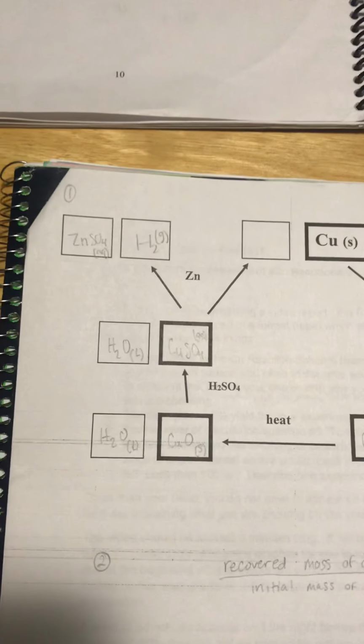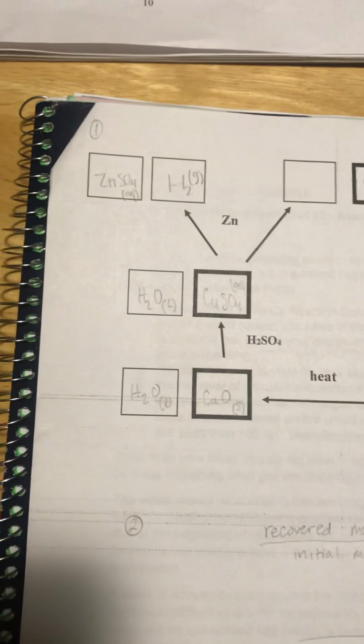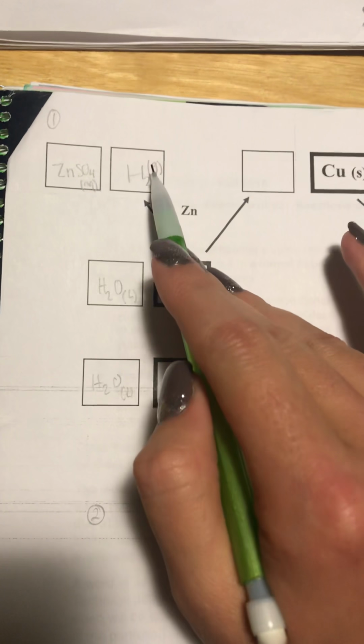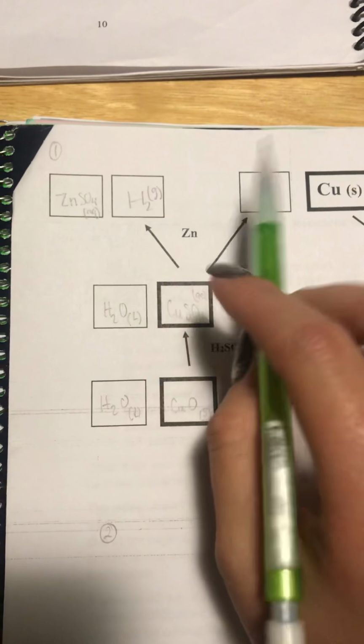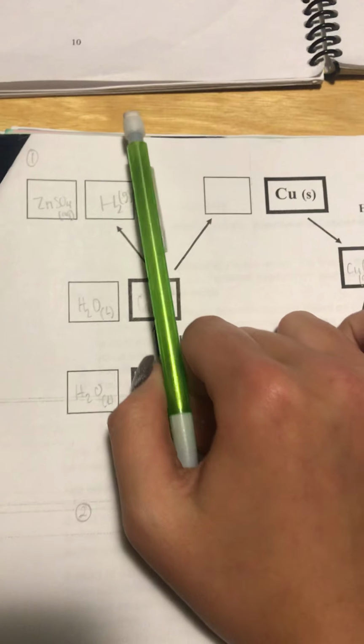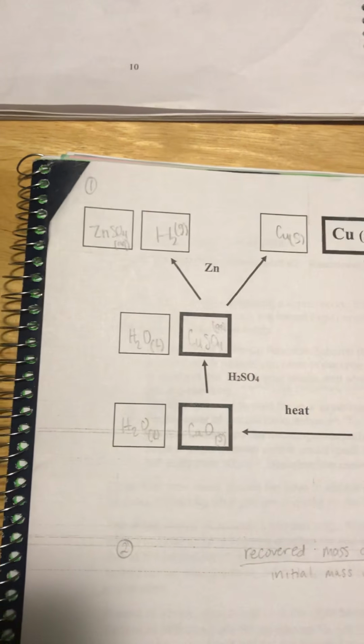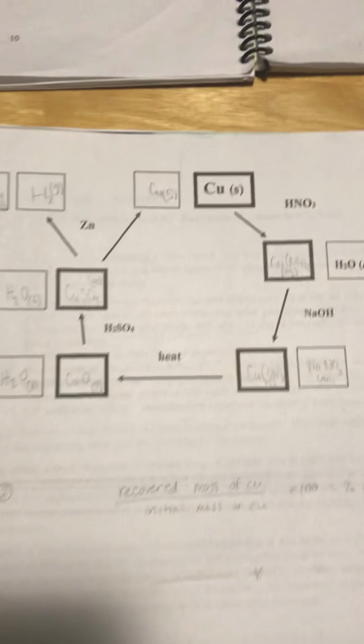And once this starts to slow down, we decant the solid within that from the solution. We also do a methanol wash throughout that, to give us back our copper as a solid. And of course, we weighed that after it dried.